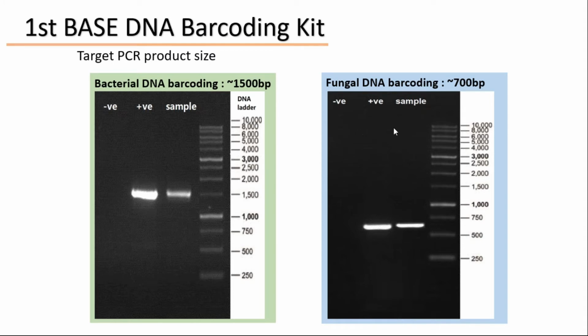If you see the gel photo from here, you can see there's a column which is labeled as the negative control. So don't forget, we always recommend users to include the negative control by using water as a template. This is to counter check whether the sample actually is qualified to proceed to the next step or not. Okay.